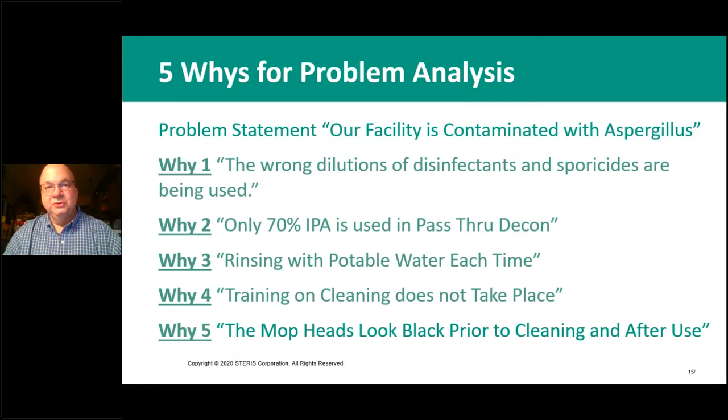They were using the wrong dilutions of disinfectant and sporicide. They were only using 70% IPA, which is isopropanol, for pass-through decon. No sporicide. They were rinsing nearly every single day with potable water. They had not done training recently in cleaning. So as a consequence, when we watched them clean the BSC hoods, you see the wax on, wax off methodology. And the mop heads, when you took a close look at those microfiber mop heads, they looked very, very black.